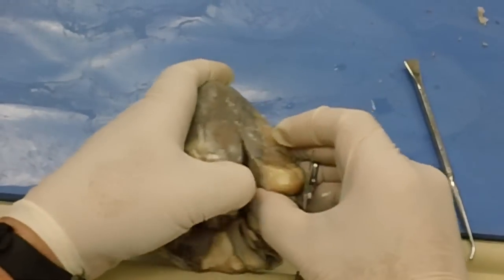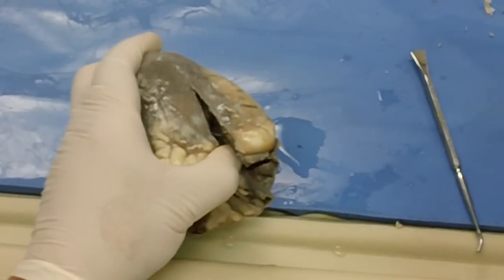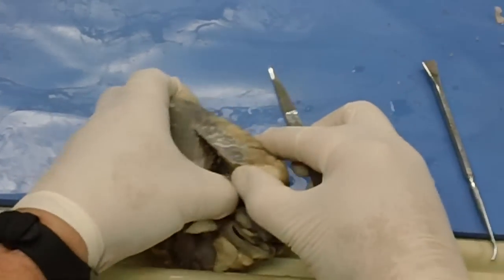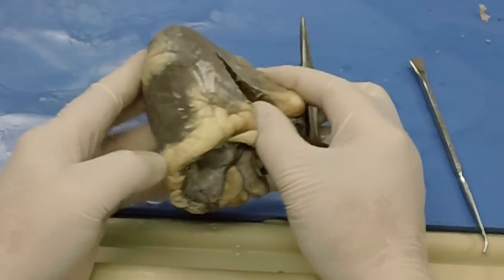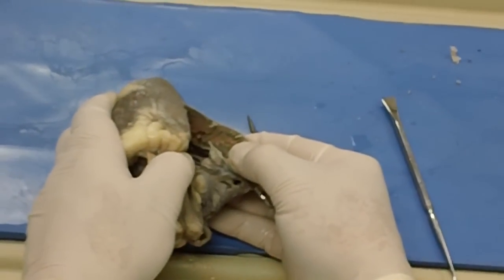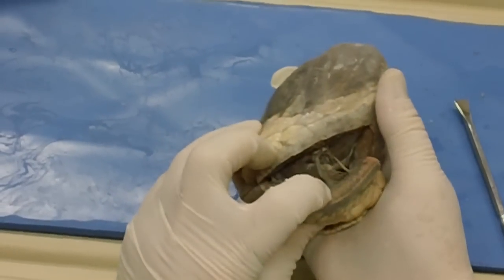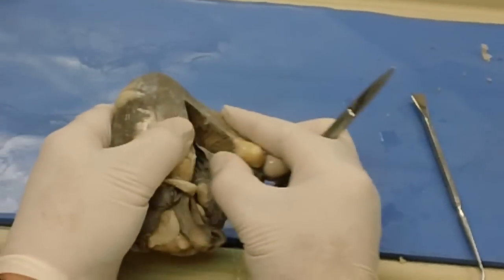And do you want the bigger scissors? You got a bigger pair? Thank you. Okay, so now we're inside the left ventricle. Look at the difference between the wall thickness of the left ventricle and the right ventricle. That's an easy way to tell which side of the heart you're in.